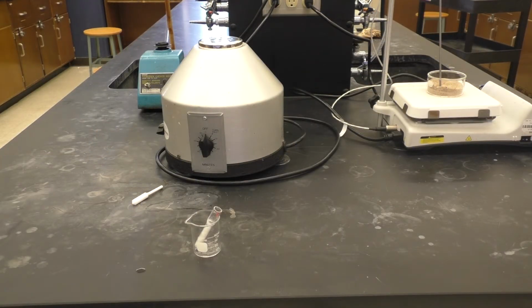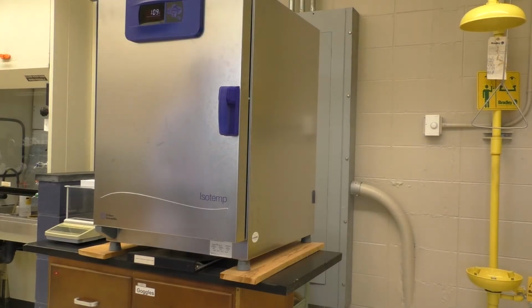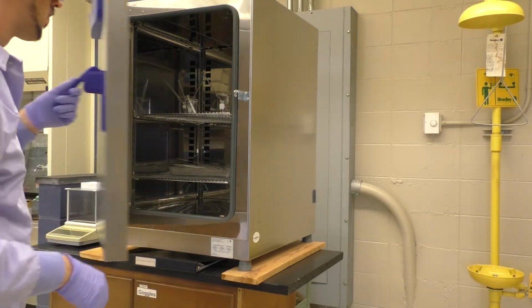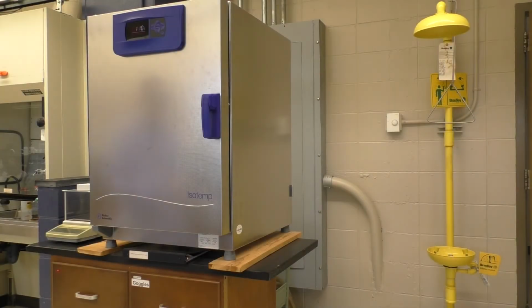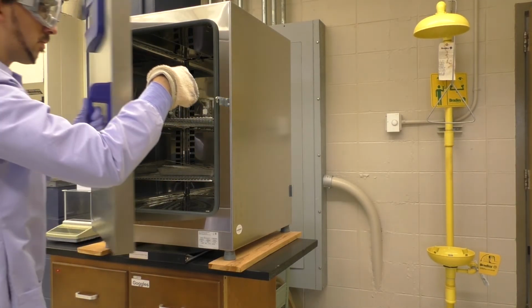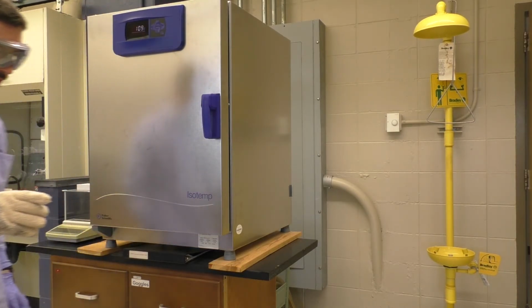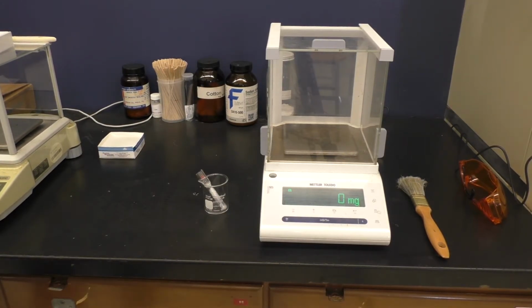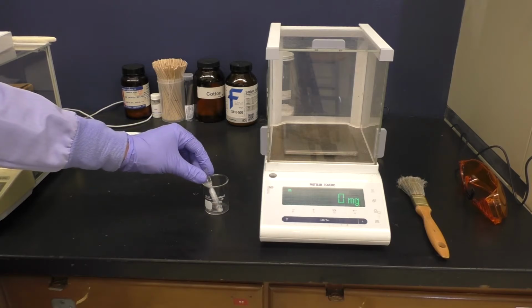We will now place the sample in the oven to dry for a period of 10 to 15 minutes to remove any residual water in the crystals. So here we have our final isolated compound. It's cooled from the oven. We'll get a final mass for it.